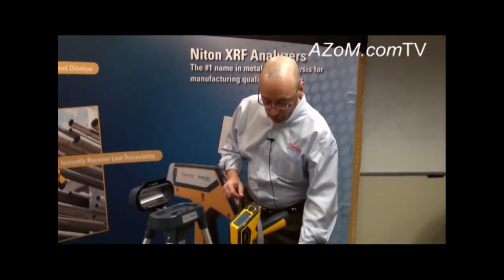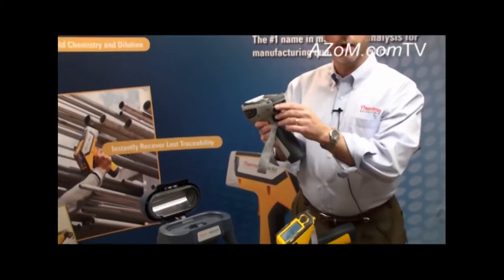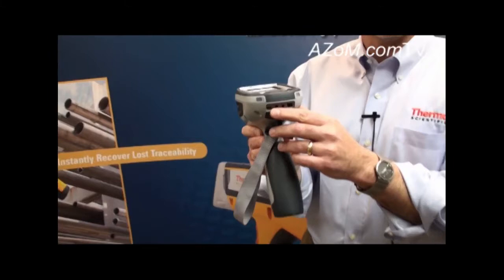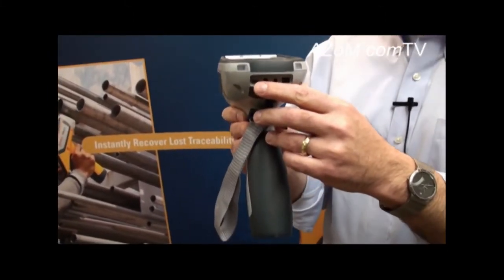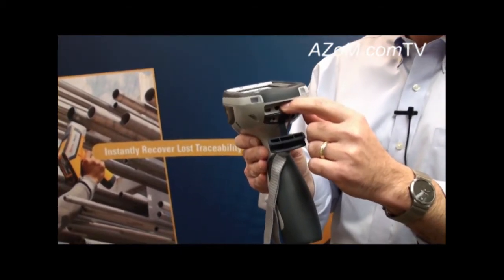Getting data from the instrument to a PC is actually one of the easiest things on the analyzer. There is a mini-USB port on the back of the analyzer, and for customers running older PCs, there is also a serial plug they can use.